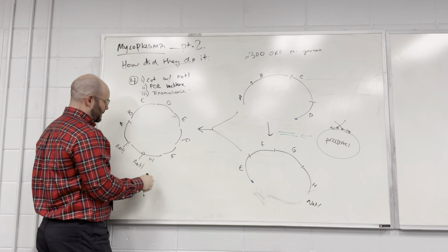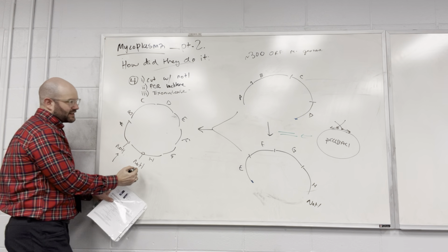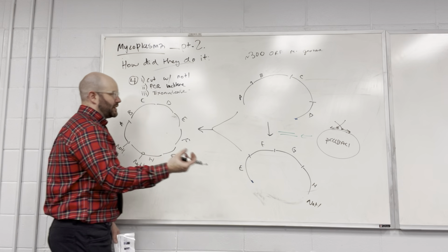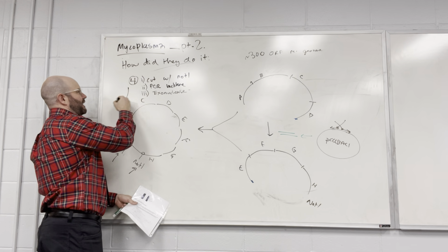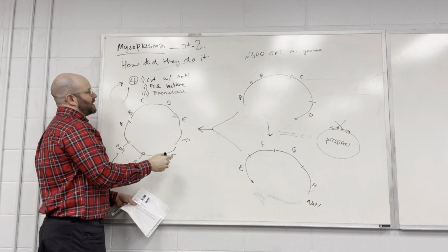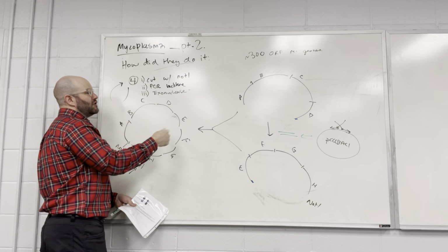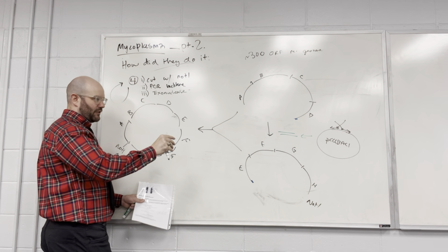And then it comes together, and they're actually adding in new NotI sites from those primers on the backbone. So what's really interesting about this process is that every time they assemble a larger fragment, they cut it with NotI, the exonuclease removes the old NotI sites, and then they add in new NotI sites with these special primers that have them built in.